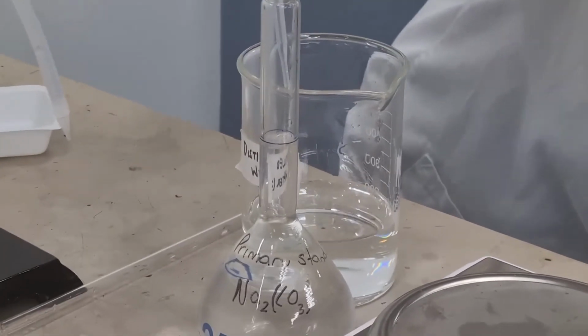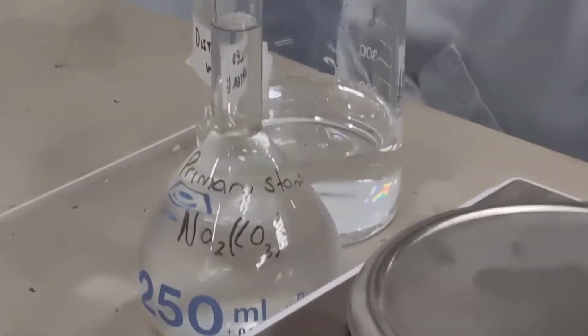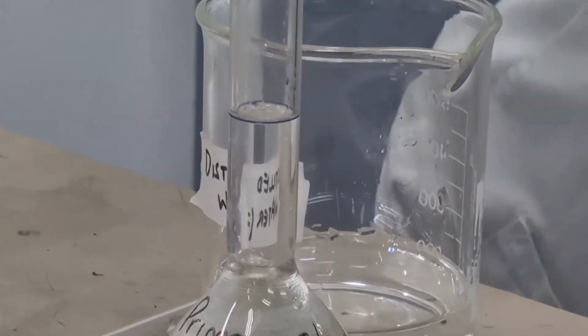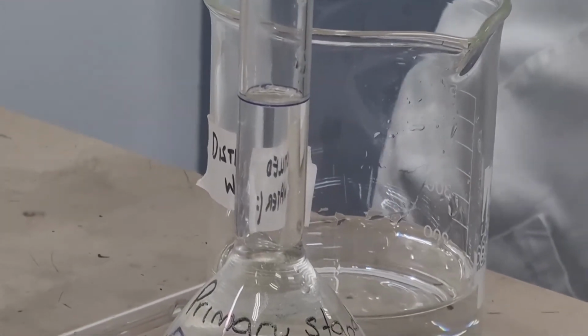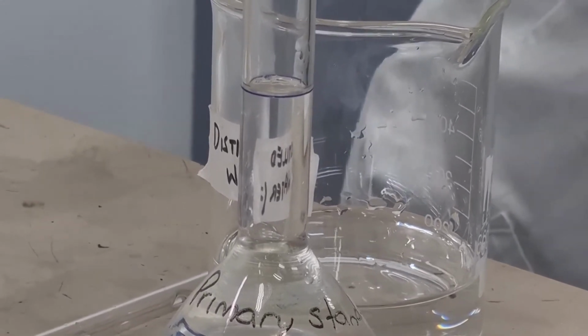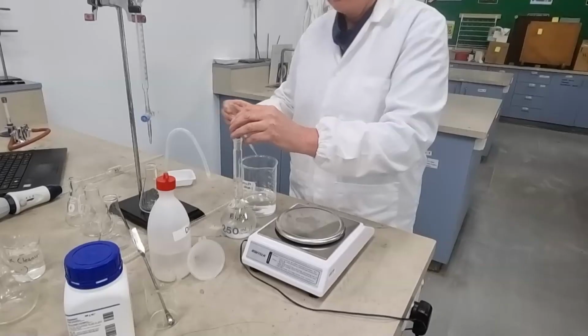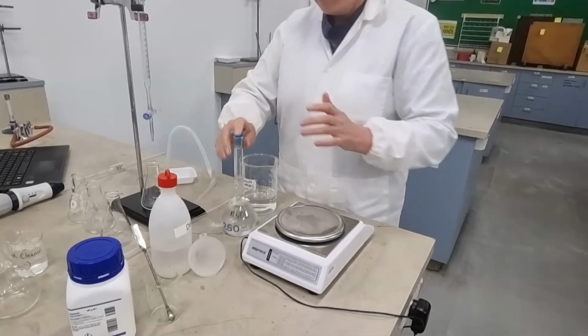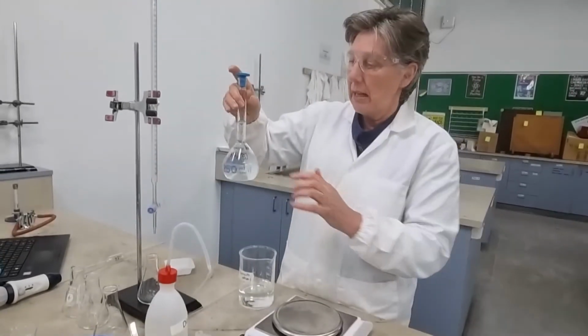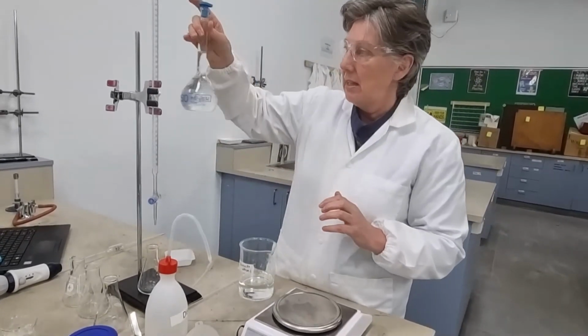And you want the bottom, I don't know if you're going to be able to see. Can you see the bottom of the meniscus there? No. It would be hard. So we'll look at that on a picture, what the bottom of the meniscus looks like, and we make it. All right, so we're going to put our standard of known concentration, and you need to work out how many moles per litre that is in here.